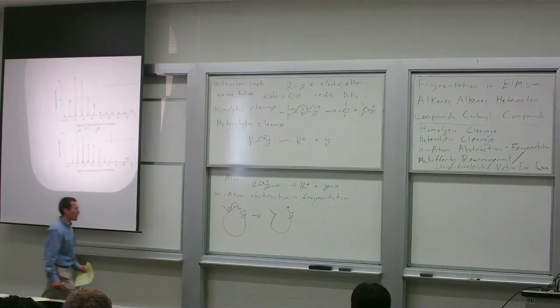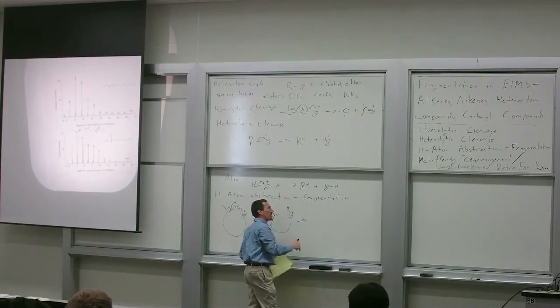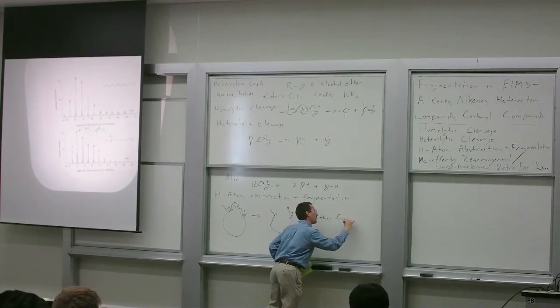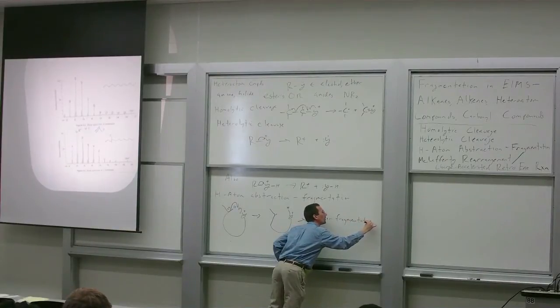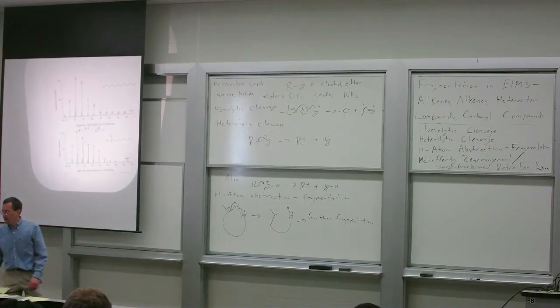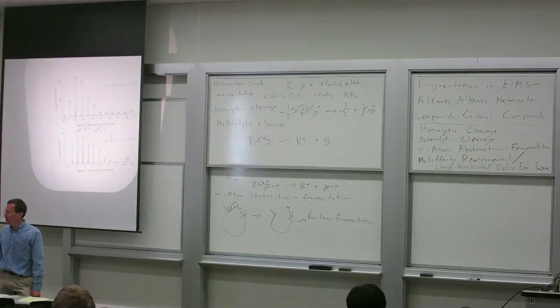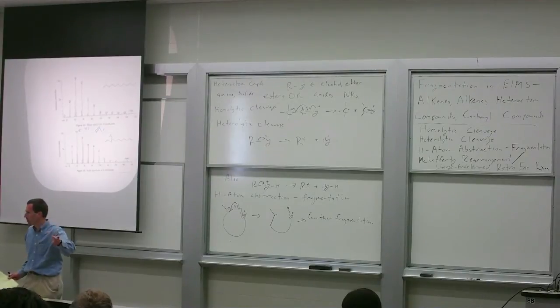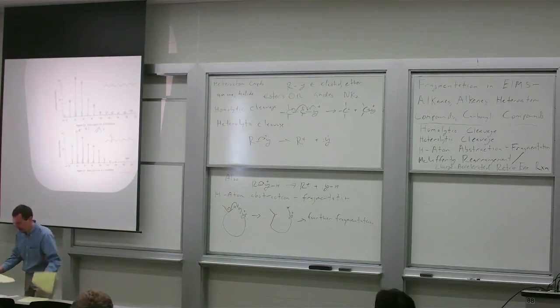And then you can undergo further fragmentation. For example, the heterolytic cleavage above. Now these are very hot radicals. The abstraction occurs largely without regard to ring size. If you're thinking about thermal reactions at 80 degrees in boiling benzene, sort of typical free radical AIBN type of reaction conditions, you're going to think there's going to be some preference for a 5-membered ring or a 6-membered ring. Here we're going to see 4-membered rings and other ring sizes, and we'll see examples of this.